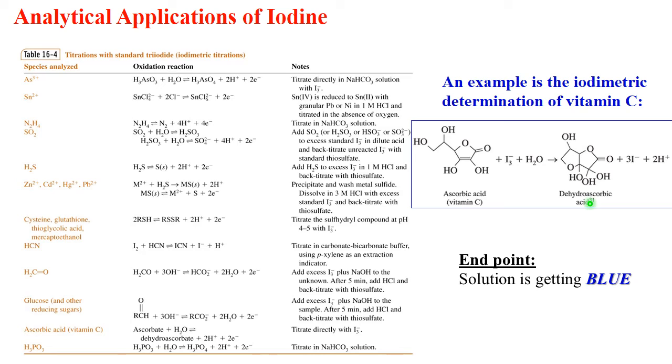Very easy titration in pharmaceutical analysis. You can titrate lots of inorganic species, written here in this table. The table is taken from the Harris textbook, as you can see. But also you can titrate lots of organic material. So for example, you can titrate aldehydes, you can titrate sulfur containing compounds, you can titrate some nitriles. So it's a very convenient pharmaceutical titration method.